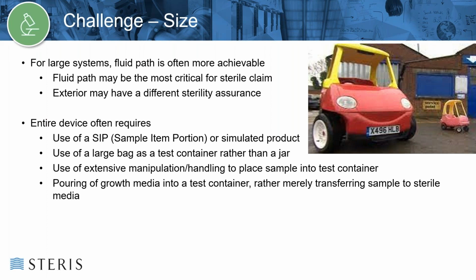The use of extensive manipulation and handling, again, to place the samples into a test container can increase the potential for contamination. And pouring of growth media into a test container, rather than merely transferring the sample into sterile media, can also potentially lend to contamination.